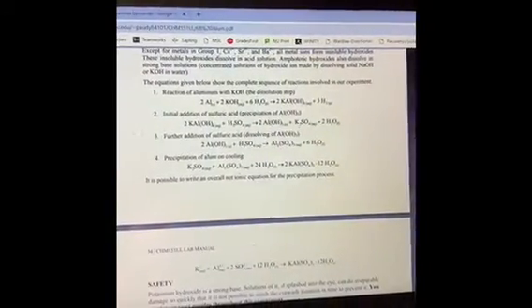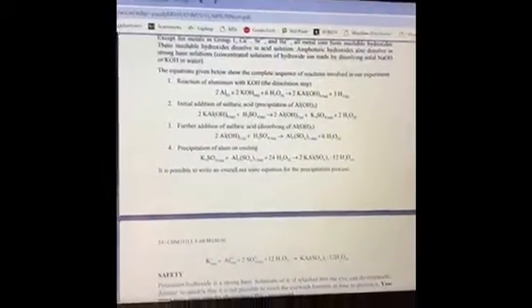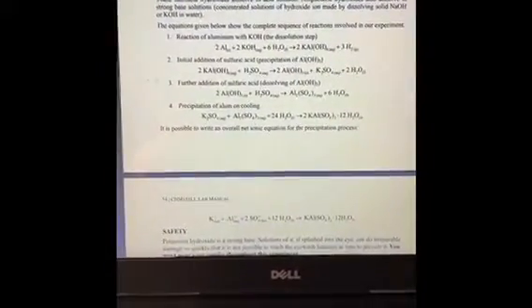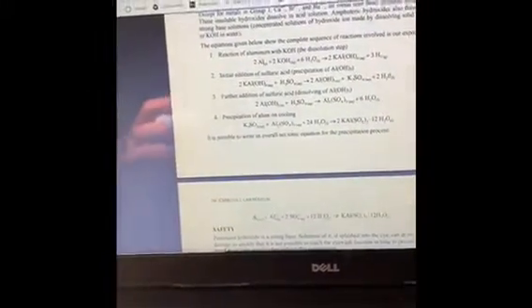In this case, we did that in ethanol and water. And the reason it has to be saturated is that when solvent evaporates out of that solution, it precipitates slowly larger, clearer, higher quality crystals, as can be seen here.